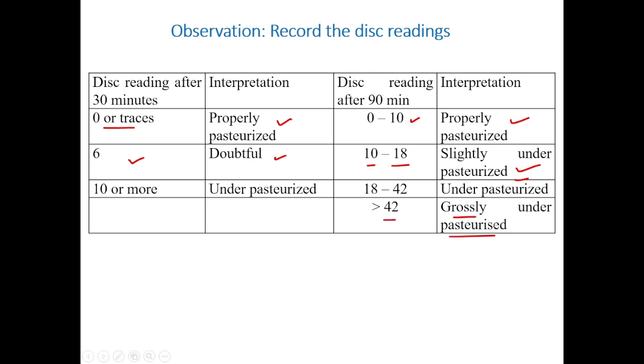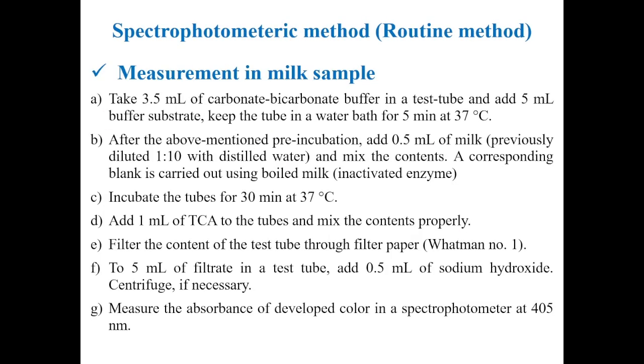So it is not pasteurized. This way we interpret whether the pasteurization has taken place properly or not using the Lovibond comparator. Now there is another method, the spectrophotometric method, a routine method. Let us see the procedure for it also.